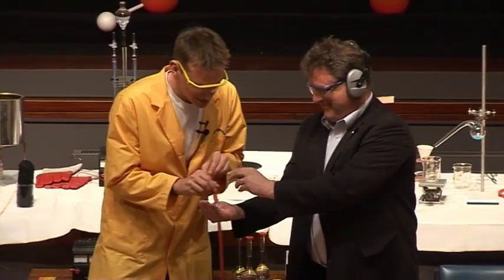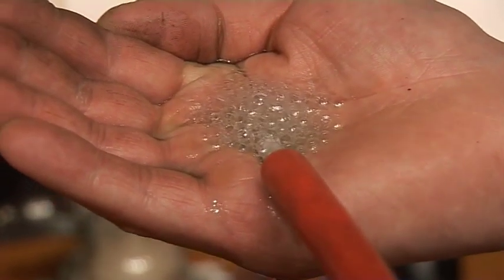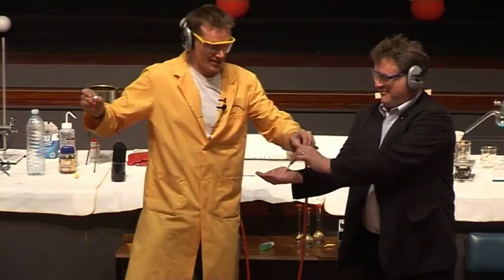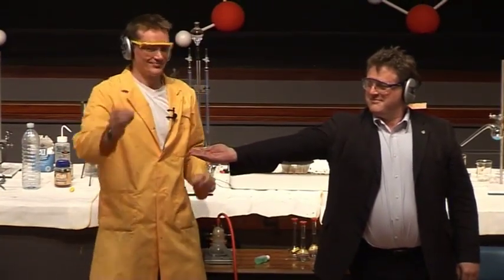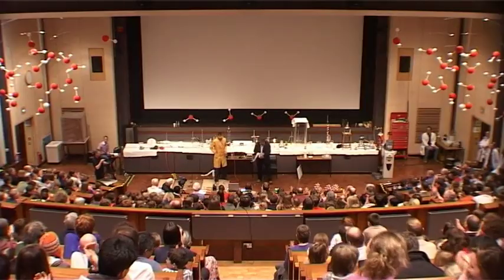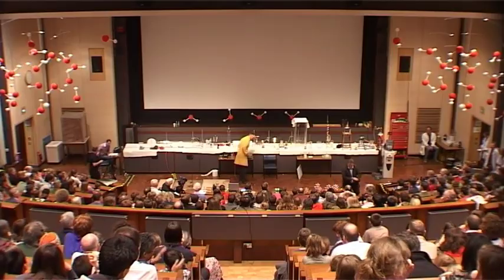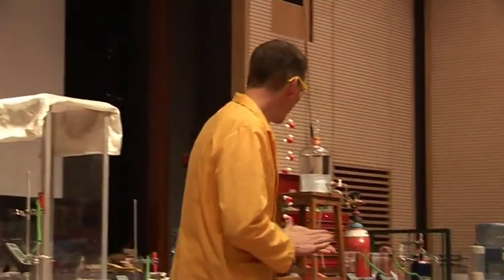Okay, now, have you got enough yet? Not quite, need to get a bit more here. If you just keep holding that, that's good. Okay, now I'm going to light it. Thank you, Paul. So, hand out. Okay, are we ready? Oh, well, very good, thank you. Great. Thank you, Paul. Right. Okay, so I hope you've still got all your fingers.